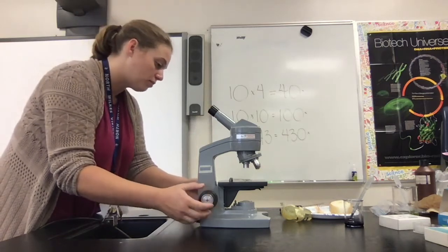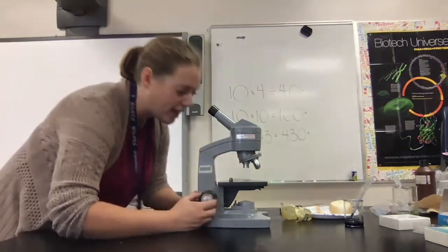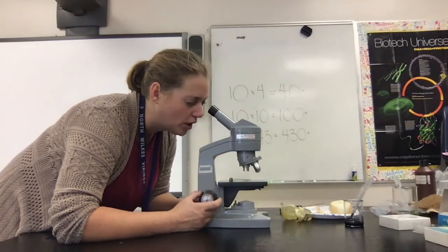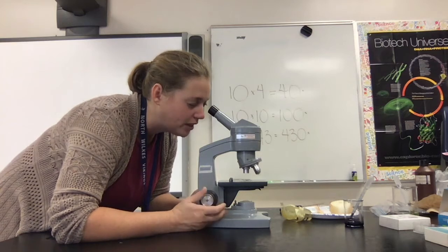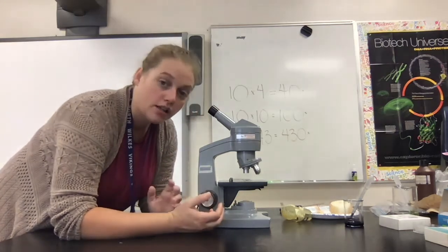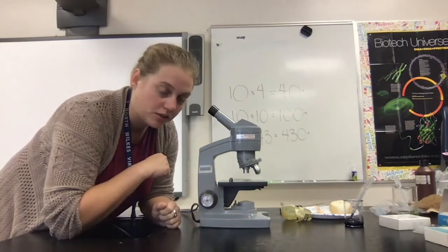So in order to focus a microscope, you're going to start with the lowest power. The objective is far away from the stage. You look into the microscope and you use the coarse knob to lower this objective toward the stage until you see detail. And once you have your specimen focused, then you're going to center the specimen in your field of vision that you can see.